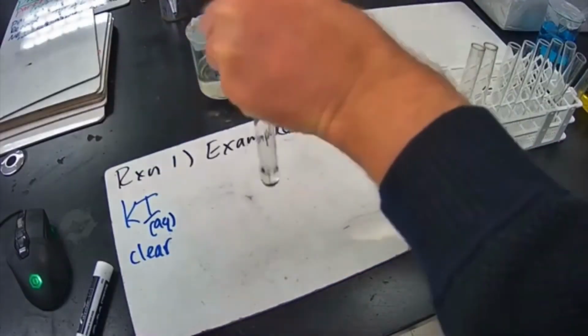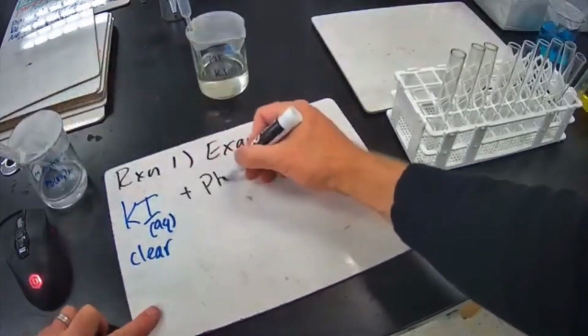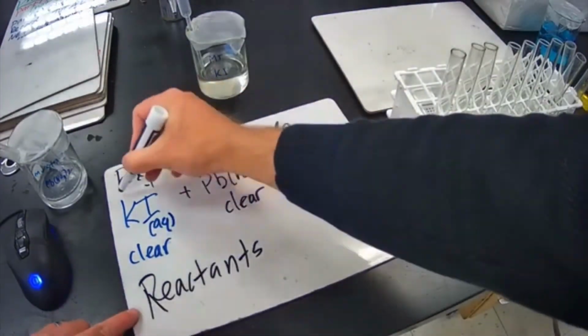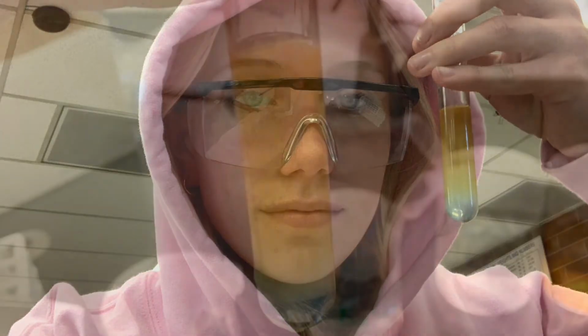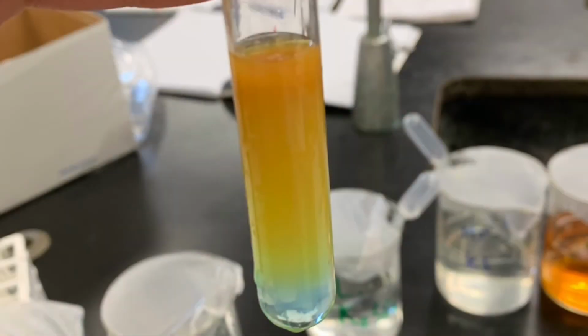In this reaction, we're taking potassium iodide and mixing it with lead nitrate. The reaction forms a precipitate of solid yellow lead iodide, and the leftover aqueous solution is potassium nitrate. Here's a precipitation I did myself with 5 different solutions. Overall, precipitation reactions are responsible for geological deposits, the rings around your bathtub, and some pretty cool chemical reactions.